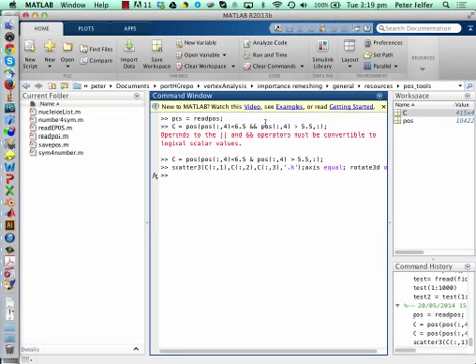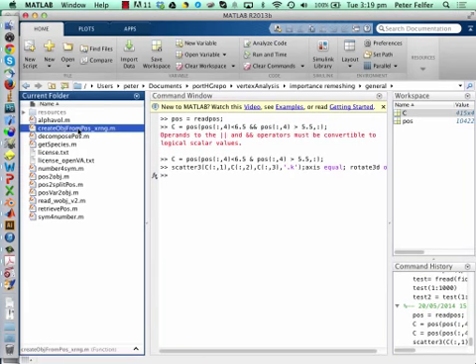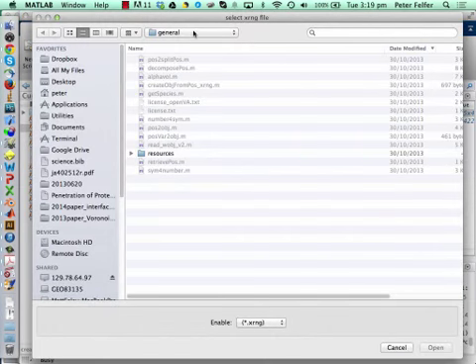This is just examples. But for standard visualization, I've created an export script that does all of that for you. So provided you've got an Xrange file and provided you've got your POS file, it does everything for you. If you go into the folder above, which is called General, there's one that says Create OBJ from POS and Xrange. You just type that in and you hit enter, and it comes up with the dialogues for you.